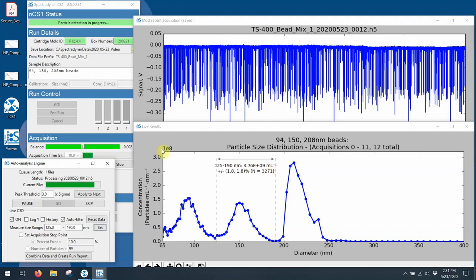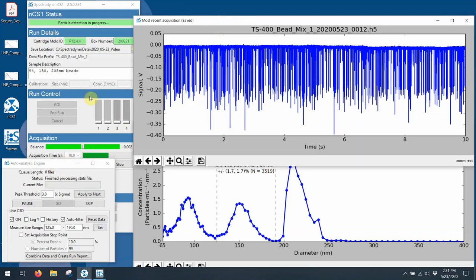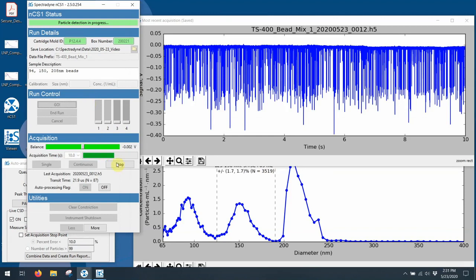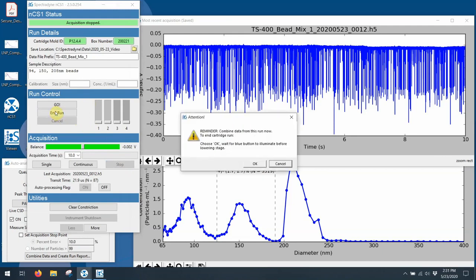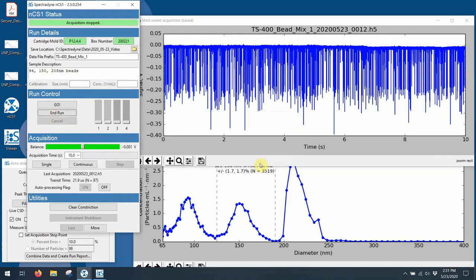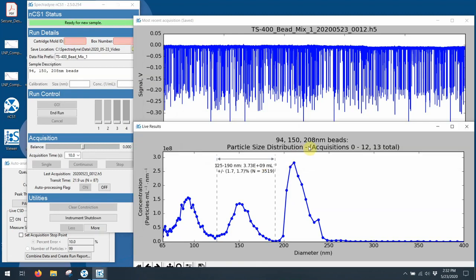So I've got plenty of data at this point. So what I can do is I can actually stop the acquisition. And at this point, it's stopped. And then what I would also do is I'd hit End Run. And what End Run is going to do is it's going to zero the pressures in the lines so that the system is ready for the next cartridge, which means I can lower the stage, put a new cartridge in, and begin a new measurement. So down here, it says 0 through 12, 13 total. So this graph here represents 13 10-second acquisitions.